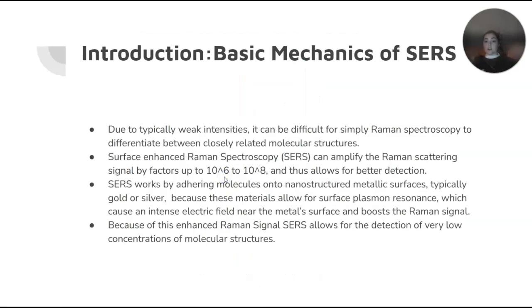So for surface-enhanced Raman spectroscopy, a difficulty with non-surface-enhanced Raman spectroscopy is that it can only detect very weak intensities, and it has a difficult time differentiating between closely related molecular structures because their intensities are just too weak.